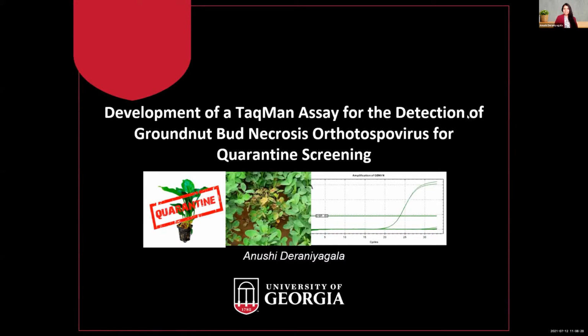Thank you, Dr. Kamrat. I'm Anushi Deraniyagala from University of Georgia. Today I'm going to present a part of my master's research, development of a Taqman assay to detect quarantine pathogen GBNV.